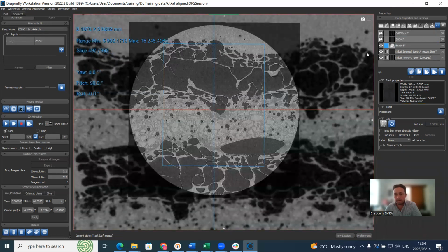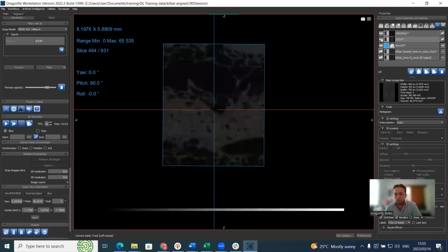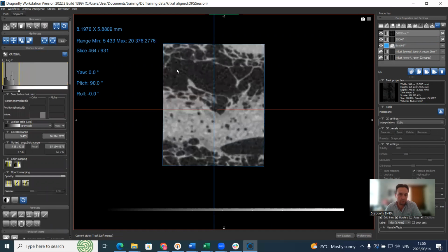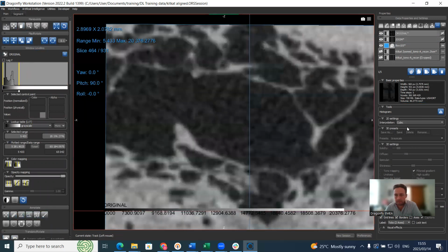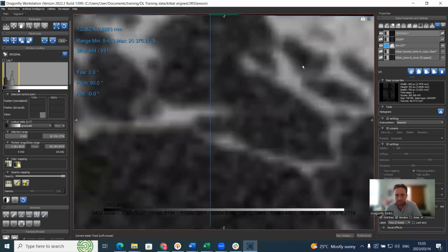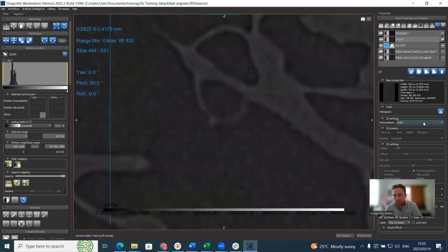Let's look at that in more detail. Let's put these images off, put the original on and the zoom on. We can, in both cases, just contrast a little bit. You don't need to do all of this, I just want to demonstrate how things work here. So if you look at this with the nearest, so that you actually see the pixels directly, this is the original scan, which was actually automatically downsampled. And this was the zoom scan, which looks like this.